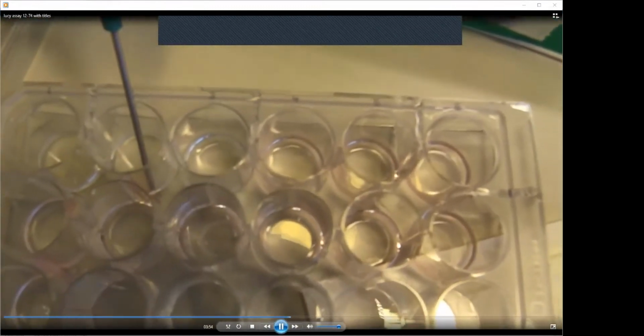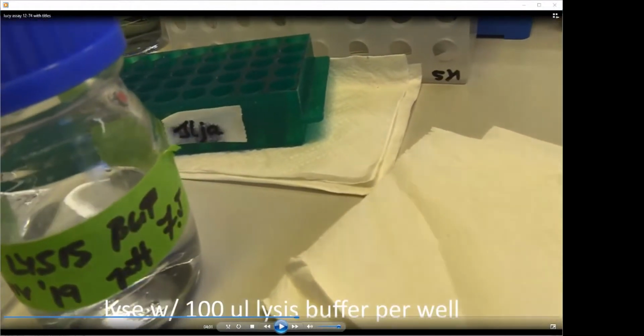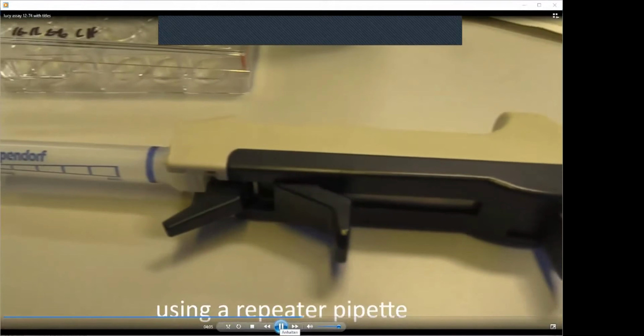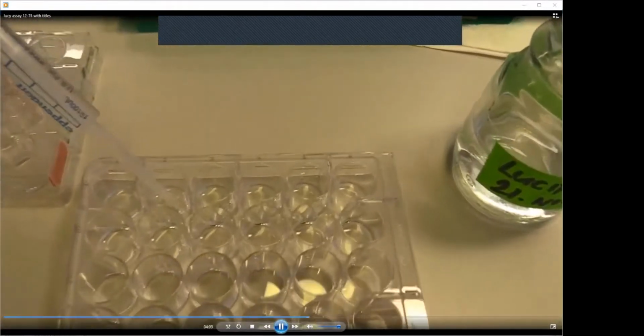So this is a similar step as you have done in the tissue culture. Try not to touch the cells, always do it at the edge of the well, because you don't want to lose your samples. Then lysis buffer is added, 100 microliters of this lysis buffer containing 2% Triton X-100 detergent. This we do with this repeater pipette because it's fast and your cells will not dry out in the meantime. So everywhere 100 microliters of this lysis buffer is added.